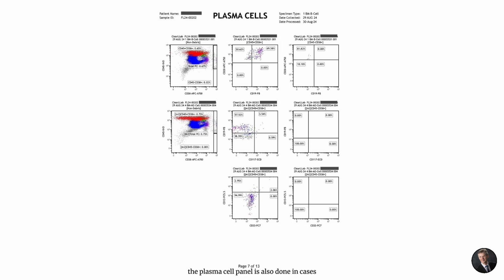The plasma cell panel is also done in cases suspected clinically for a plasma cell neoplasm, regardless of plasma cell percentage or their surface markers.